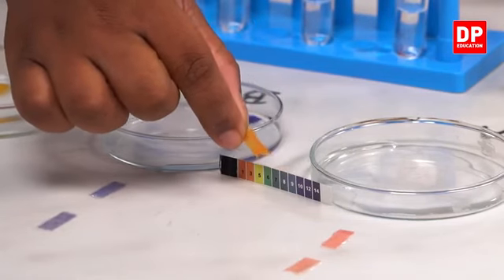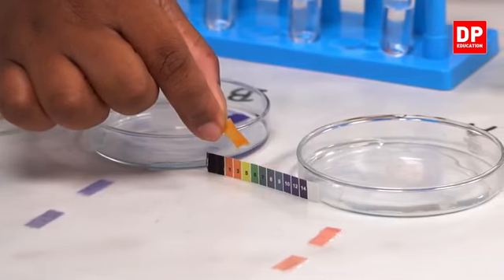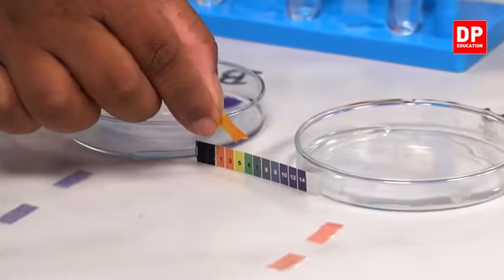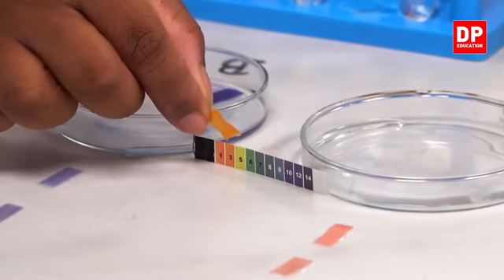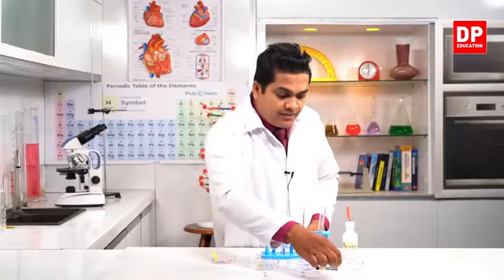It's between 3 and 5. Between 1 and 3, the pH value is about 2. Yes, the pH value is about 2. So here, see the color? The pH value is about 2 in here. Right? pH is about 2. So I'll keep the pH paper here.